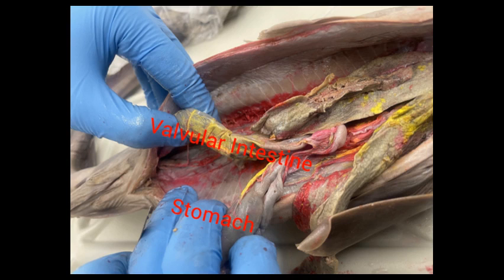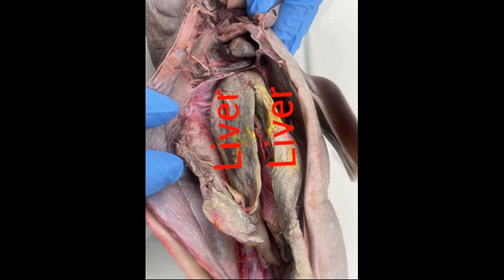Food from the stomach then moves into the valvular intestine, through the spiral valve into the intestine, which is the major site of digestion. Next we should talk about the accessory digestive organs that I might have forgotten to mention earlier, which include the liver and the pancreas. The liver and pancreas have ducts that empty into the duodenum.